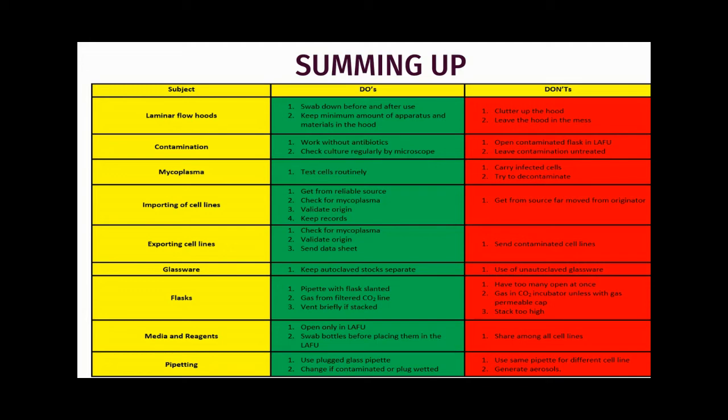For contamination, do's are: work without antibiotics and check cultures regularly by microscope. Don'ts: never open a contaminated flask inside the hood, and never leave a contaminated flask untreated — it should be treated with a caustic agent or a strong base.